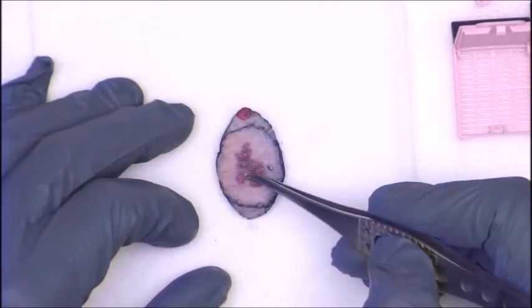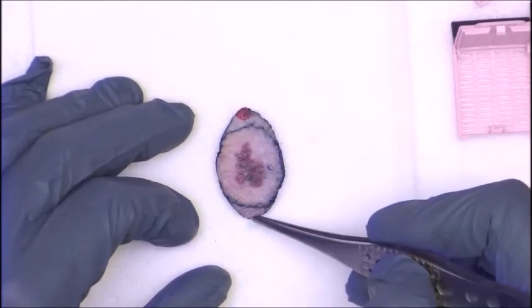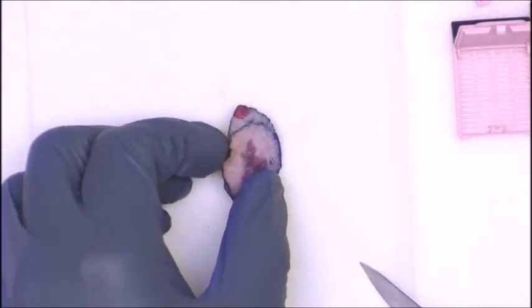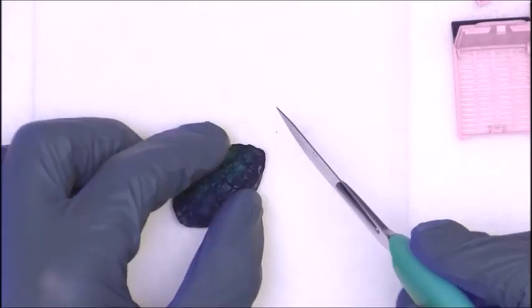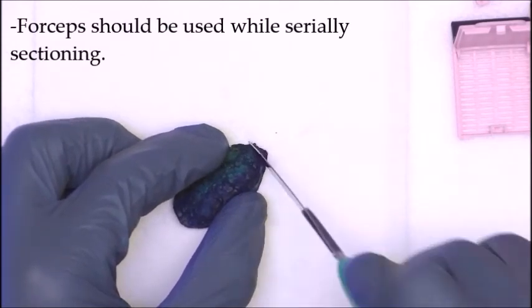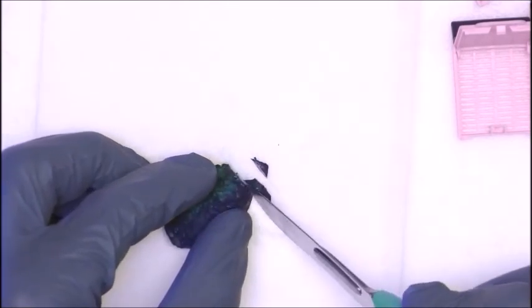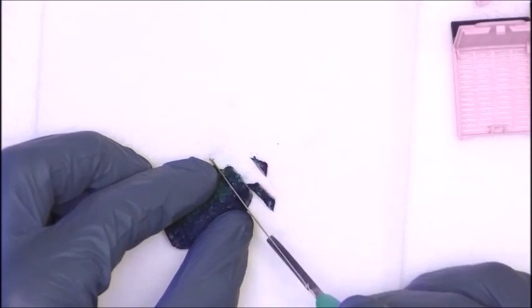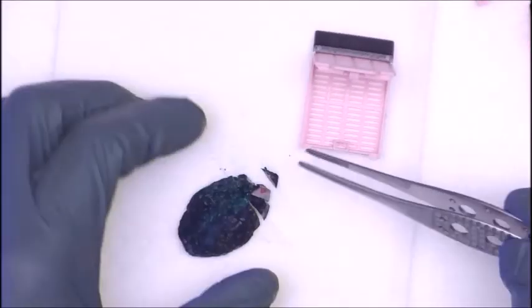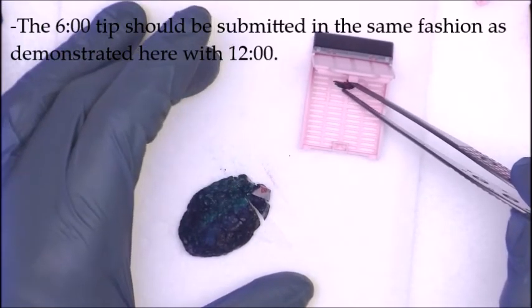Here's our lesion. And what I'm going to do is section it from 12 to 6 o'clock and submit it sequentially. And what I like to do is cut from the soft tissue side first. So we're going to do our tip here, okay? And then I'm going to do a couple more sections. Stop right there for a moment. And then here's our cassette. And what I like to do is put the tip down like this. I'm sorry, not the tip down, but the cut surface down like this.